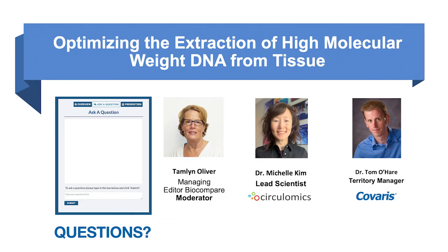Okay, Mary, maybe you can answer this one too. How viscous is the DNA after extraction, and how do you deal with it if it is too viscous? I am going to take that one and pass that one to Michelle. Michelle, is that okay? Yes. The viscosity of the DNA will depend on the size of the DNA and how much DNA is in there. So if you're extracting from a sample that is going to have tons of DNA, 10, 20, 50, 100 micrograms in your eluate, that's going to be pretty viscous.